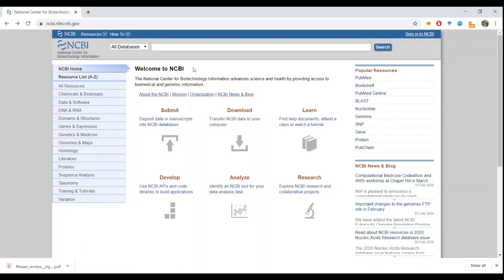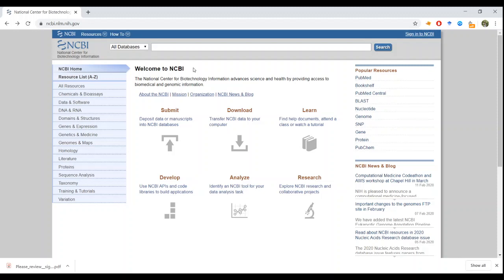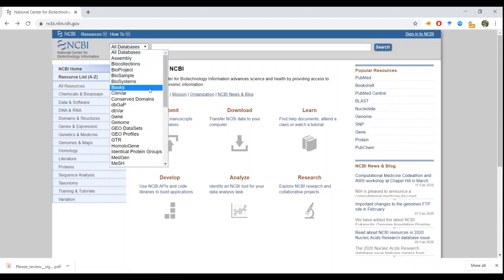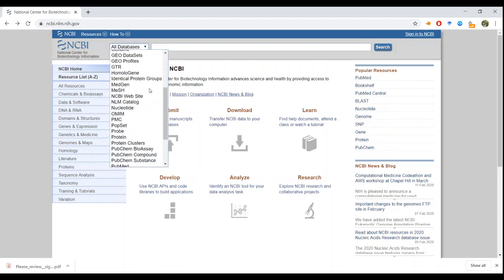For this tutorial, I'll be going over some internal transcribed spacer sequences, ITS. ITS sequences are one of the standards for genetic analyses of fungi. If you want to differentiate between two seemingly identical species or cluster different species together to see how similar they are.